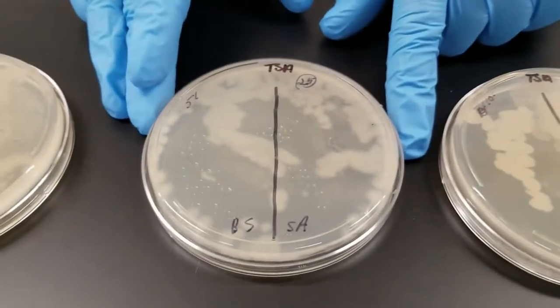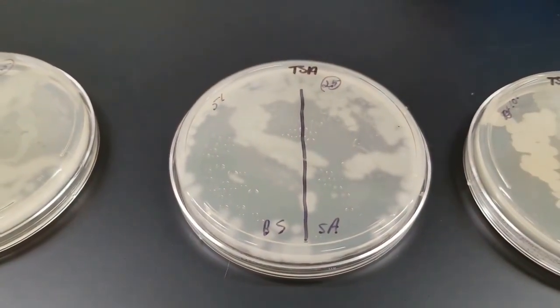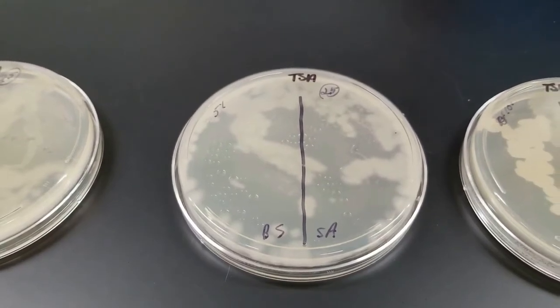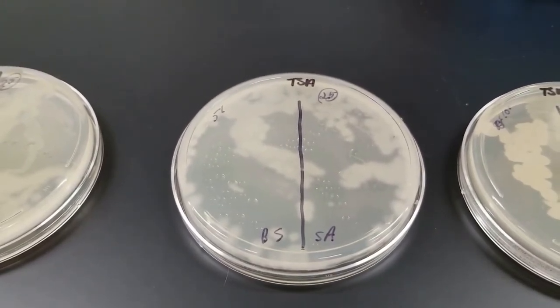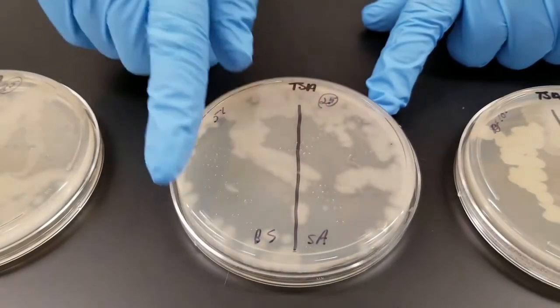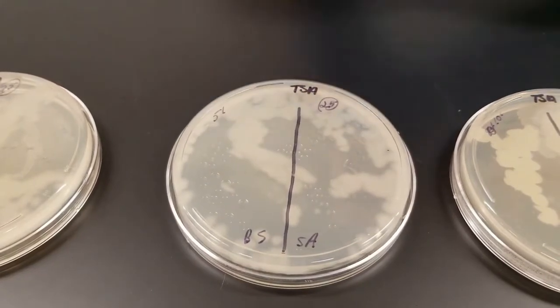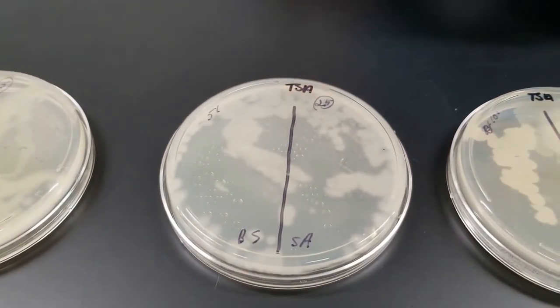This plate right here, we inoculated, and then the plate was exposed to UV light for 5 minutes to test the effects of the UV light. We don't really see Staph aureus growing. You do have Bacillus that is growing and has managed to grow around the plate. Remember, Bacillus produces spores, so that is a protective mechanism.